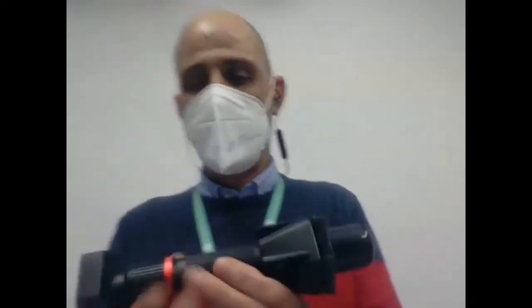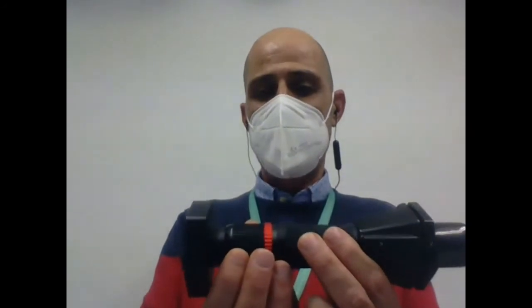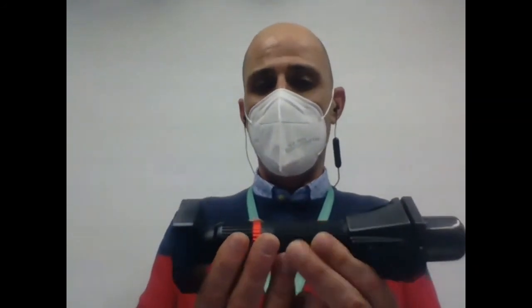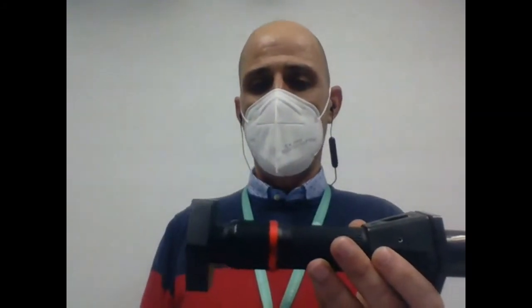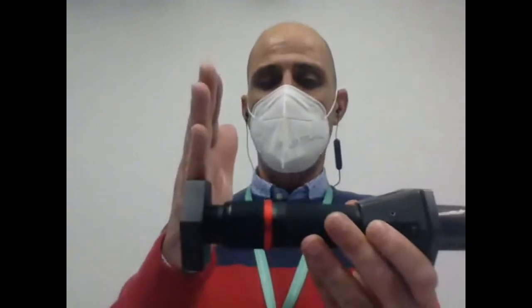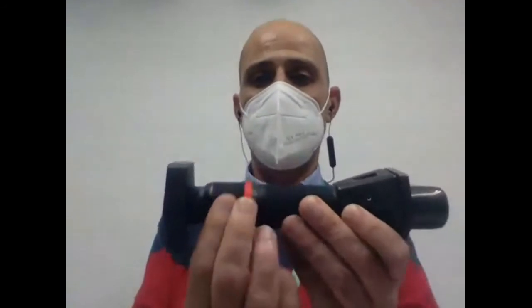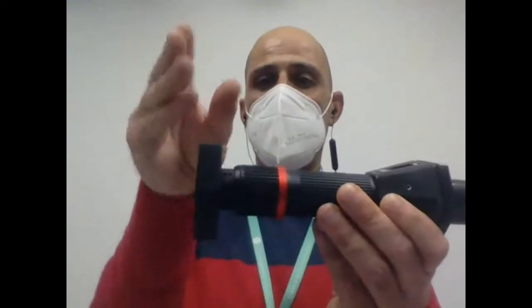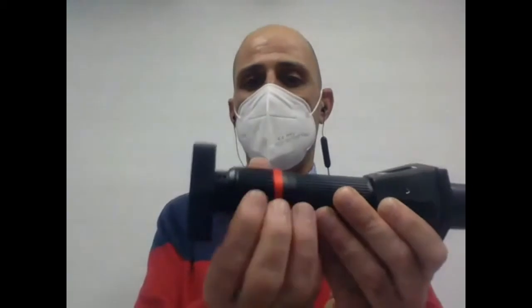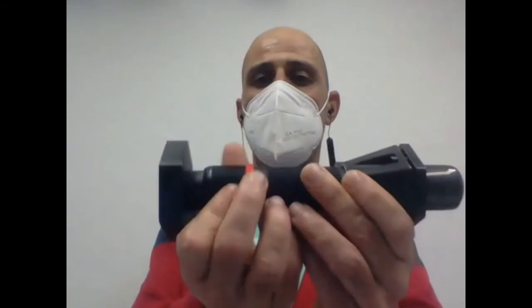Well, what we do, as I said before, is adjust the exit pupil of the microscope to the location of the micro lens array and the sensor. So we have this system that moves the micro lens array and the sensor together in front of or behind the exit pupil of the system.